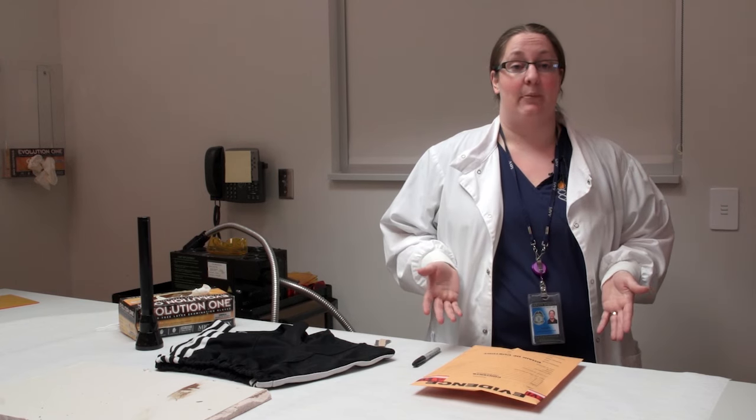Today we're actually bringing the classroom here to where my home is and where I work - the Johnson County Sheriff's Office crime lab, our new state-of-the-art building. What I'm going to talk to you about today is the evidence process that we go through for DNA analysis and biological processing: when we get a piece of evidence in, how we're going to look through it to find any body fluids and then take those on for DNA processing.